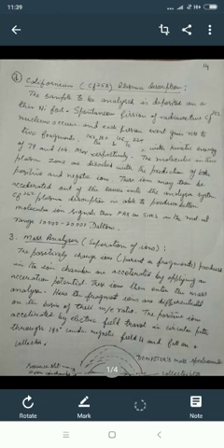Spontaneous fission of the Cf-252 nucleus occurs, and each fission event gives rise to two fragments. The Californium breaks into two fragments, barium and technetium: barium 142 and technetium 106, with kinetic energies of 79 and 104 MeV.